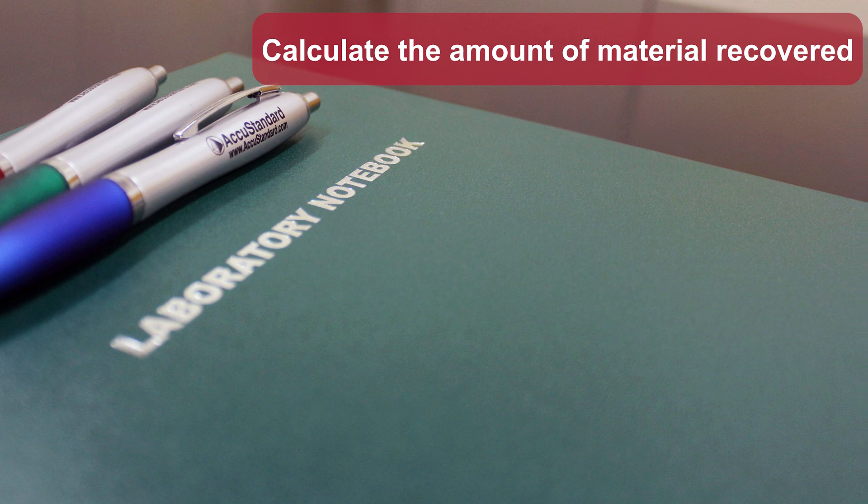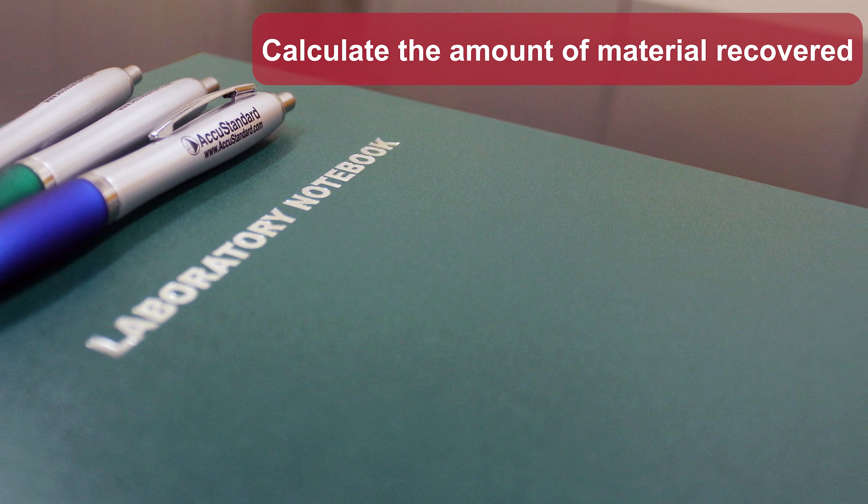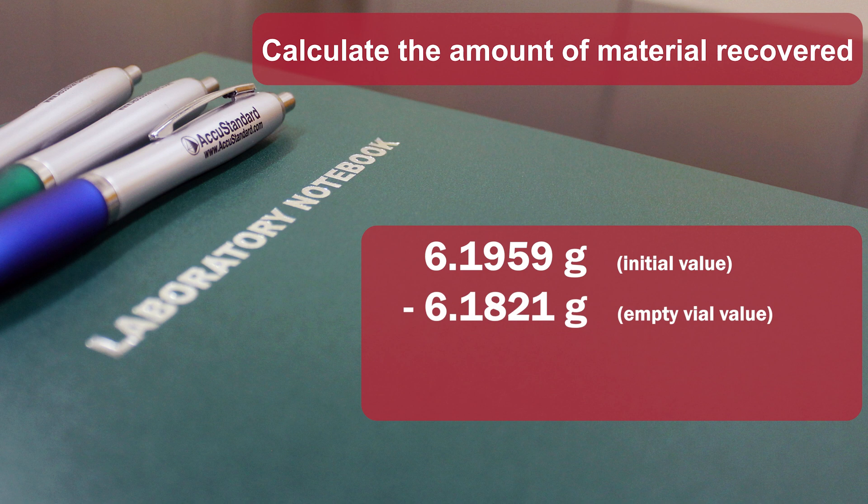Calculate the amount of material recovered. Take the initial value, subtract the empty vial value, and you have the total amount recovered.